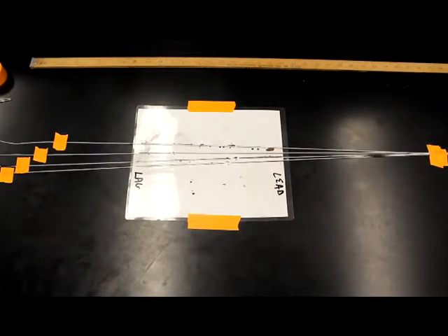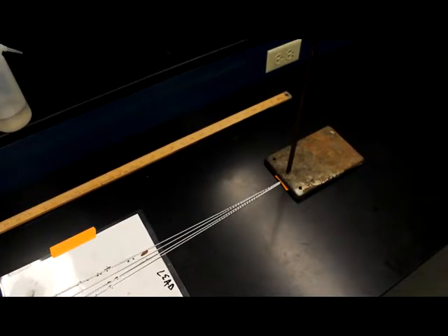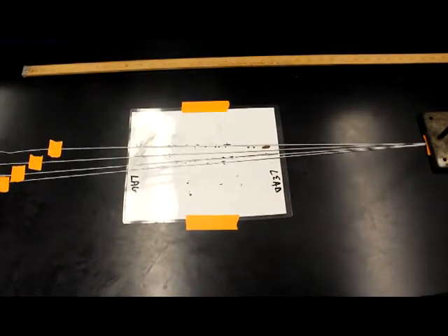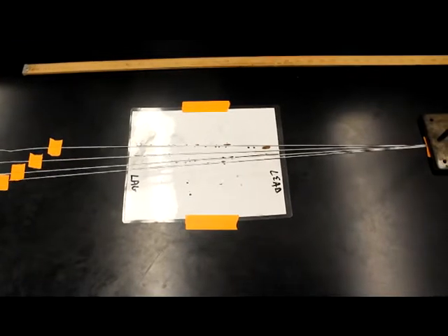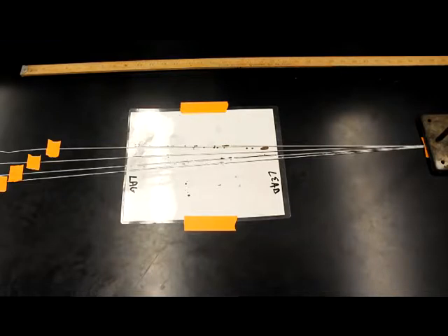From here, we've got a general point of convergence, right? And now we need to work out angle of impact. If you follow your strings down to a rough point of convergence, you can see we've placed the chemistry stand at that point, so that it gives an approximation of where these 4 different blood spatters came from in location. The next thing we need to do is work out the angle of impact, and for that we're going to need 4 more pieces of string, and they're going to need to be somewhat longer than the 4 pieces that you started with, so that you've got plenty of room to work with.